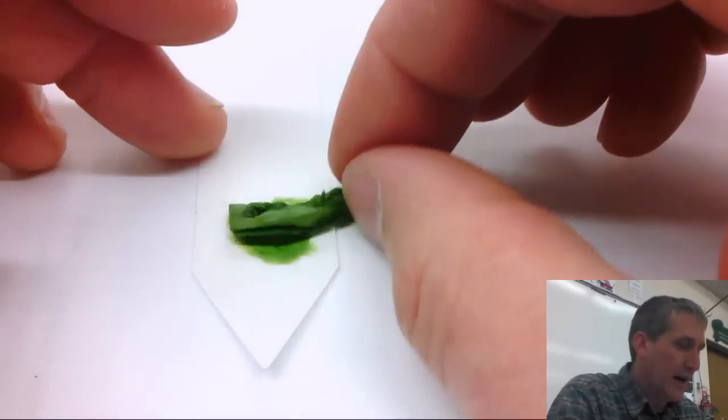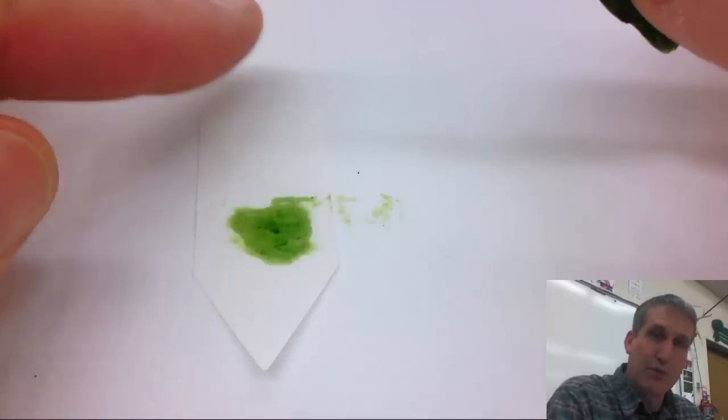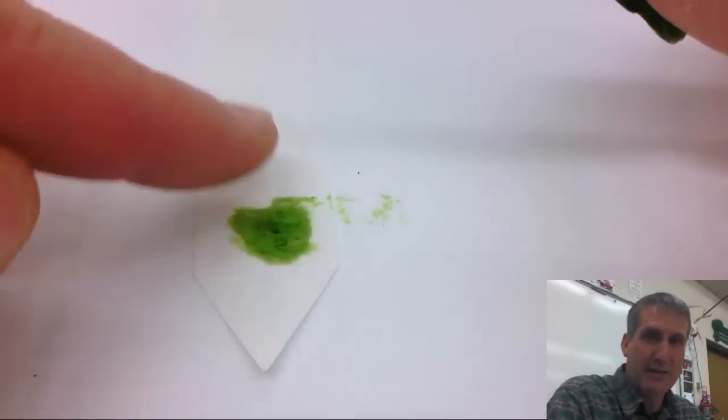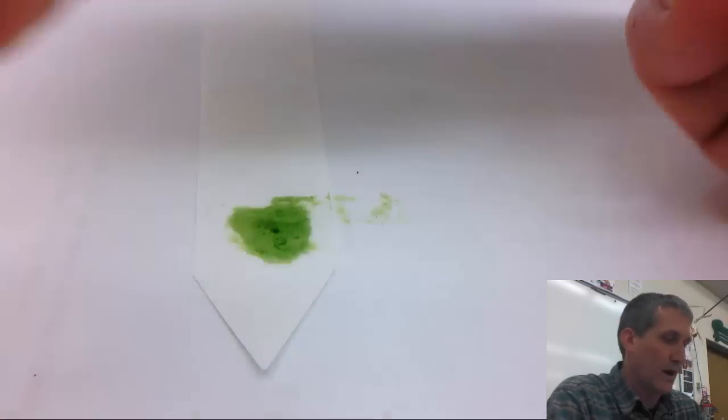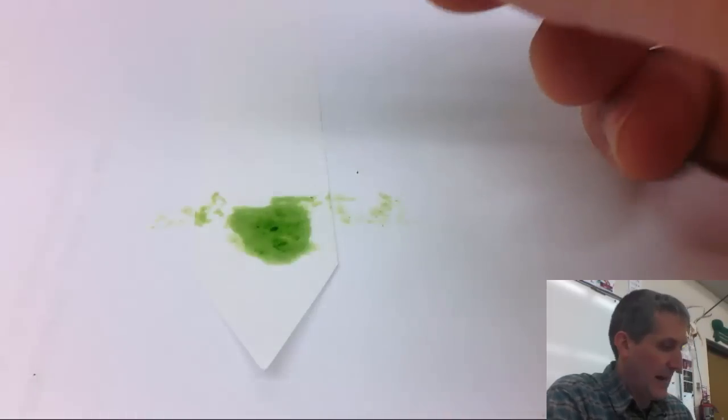The more concentrated you can put the pigment the better. If you spread it all over the place it's not going to work as well. So try to keep the pieces concentrated as you can.